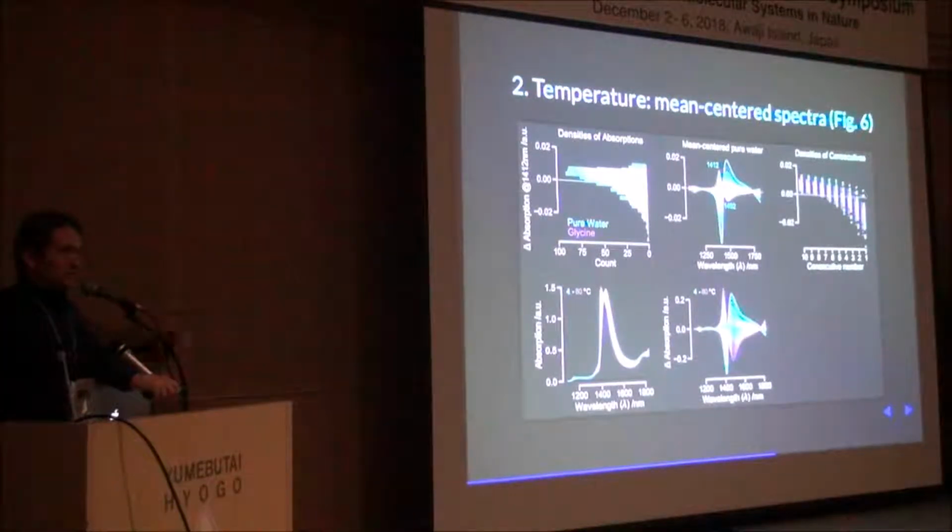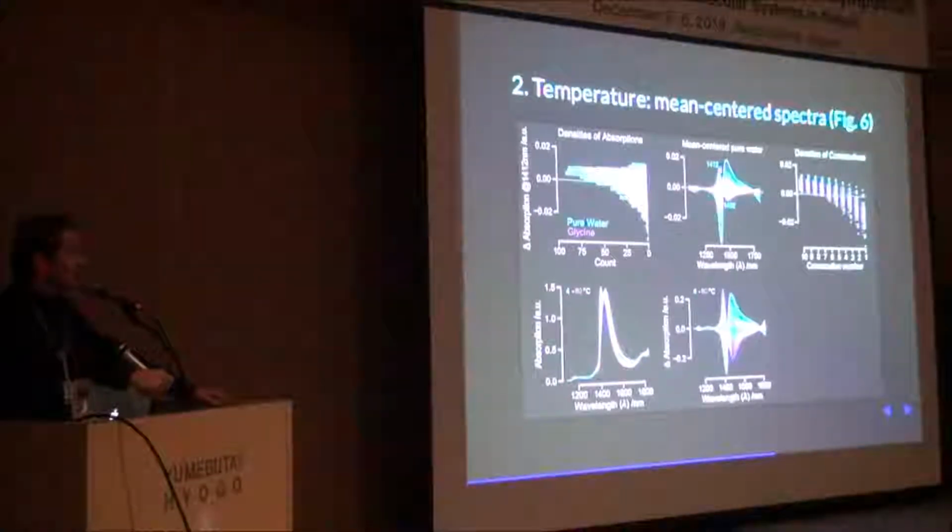So the only contact with the different temperatures was while I was pipetting from the jar, from the flask, to the cuvette. So that's the only temperature perturbation. The rest of the meaning of cold to hot spectrum is due to the influence of light. So the infrared source is heating the sample and it's creating these differences.